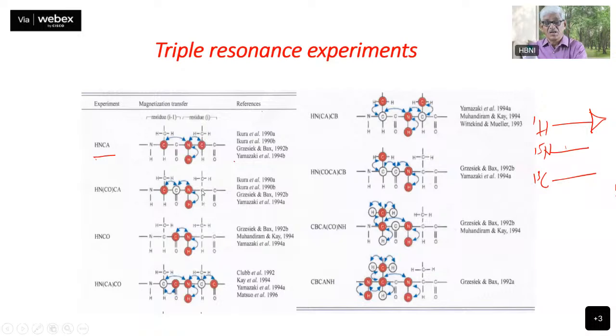This is because of the carbon frequencies. If you remember the carbon spectral region, the carbon spectra, you have the aliphatic here, the aromatic here, and the carbonyl here. This is the carbonyl here. This is the aliphatic, chemical shifts. And these are aromatic. So we don't worry about the aromatic here.